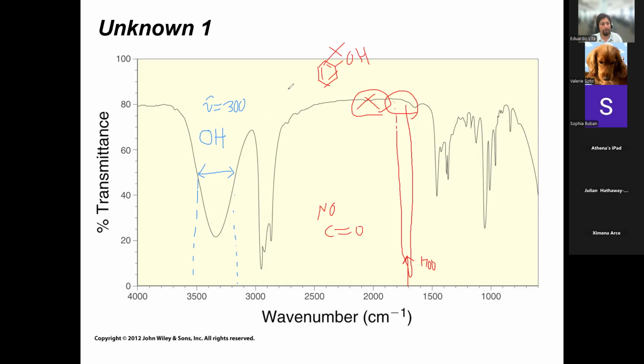The last thing that we can confirm based on the spectra, remember, if you have OH, you must also have a carbon-oxygen single bond between 1100 and 1200. And so I see this bond right here. There's nothing else in this region. I can just say very confidently, this is your carbon-oxygen single bond right there. Because the OH is carbon, oxygen, hydrogen, right? So this carbon-oxygen is this one over there at about 1100. Okay, so you'll list it. It is part of the analysis. Can we tell anything else? We cannot tell anything else, right?